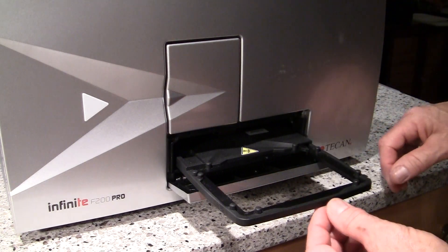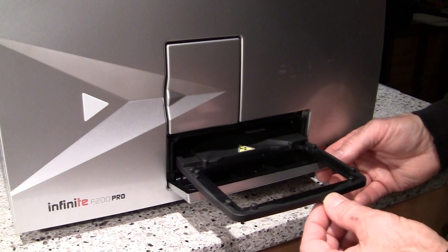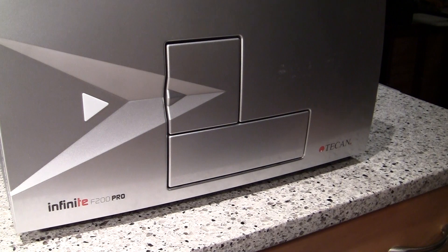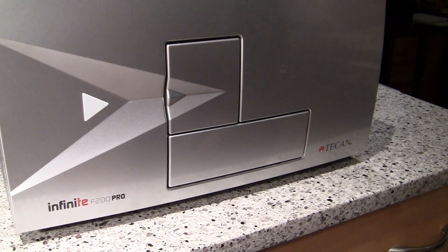Set that aside, and then gently slide the plate carrier back inside the instrument until the door is closed. When you're done with this, you're ready to plug the instrument in and begin to operate it.